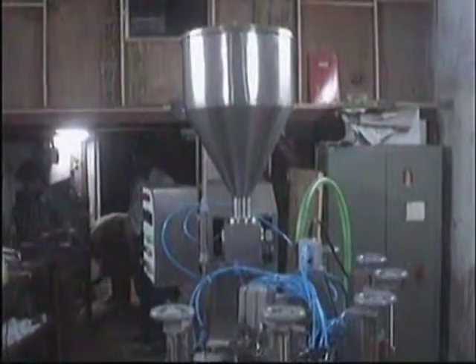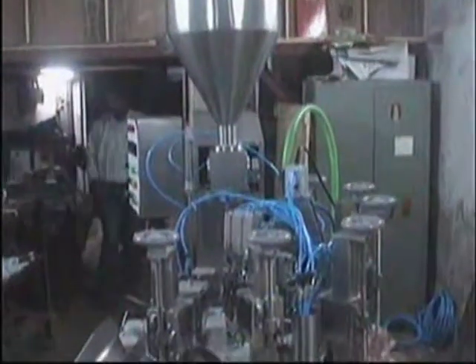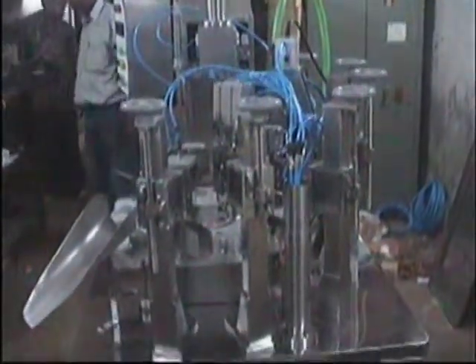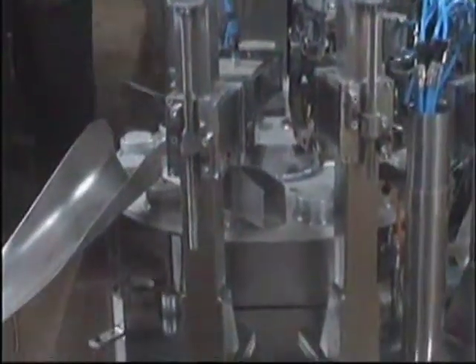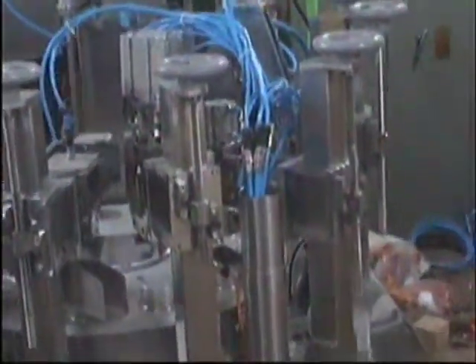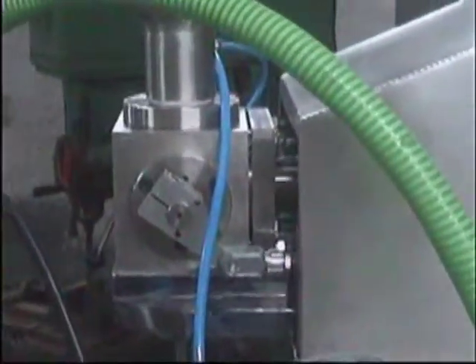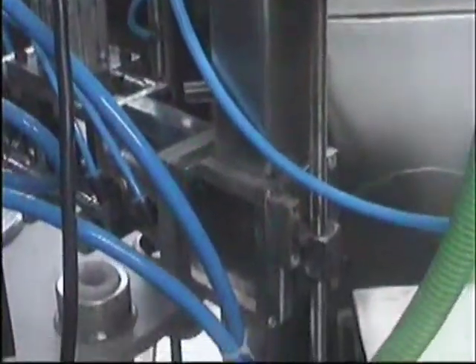You are seeing the combi machine from the right side. This is the rear view of the machine.